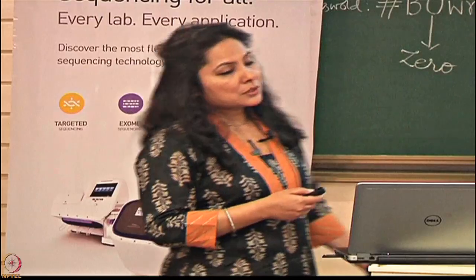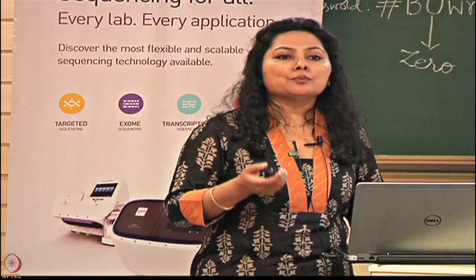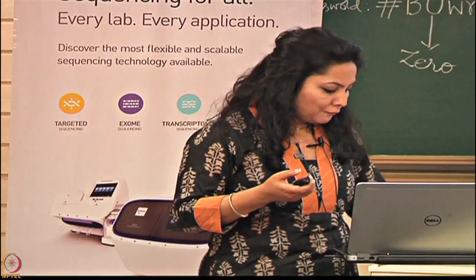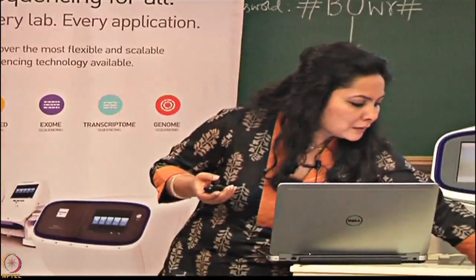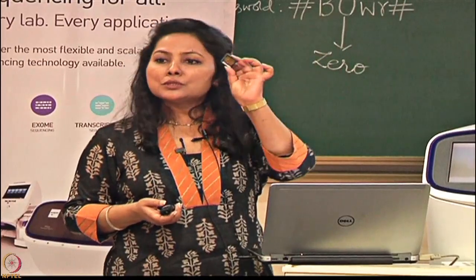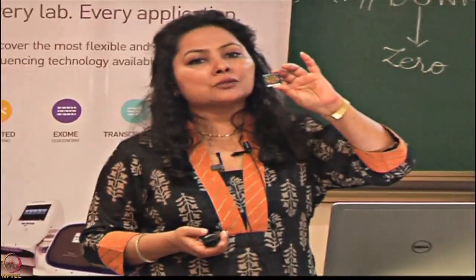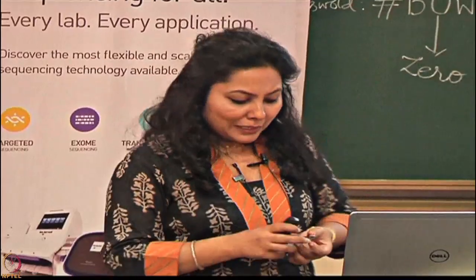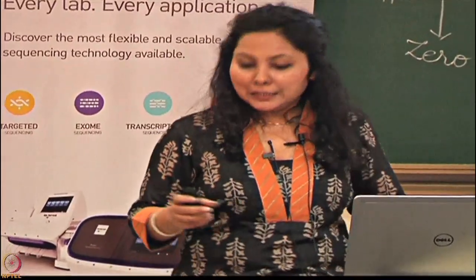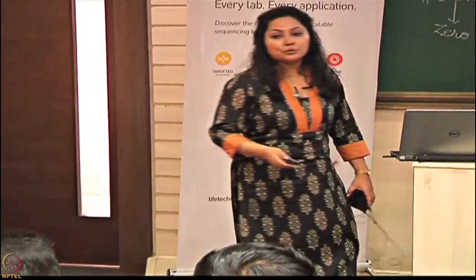Coming to next generation sequencing. Now, as I mentioned, this is a technology wherein you have millions of wells. These are the chips which are used with Ion technology, and you have millions of wells on these chips. You can imagine that each well has a sequence, and that is how you are generating millions of sequences in a run.